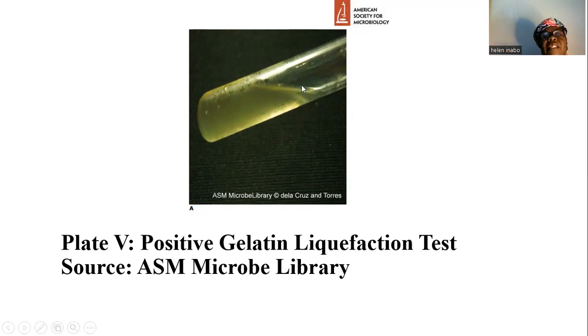See the evidence of gelatin liquefaction here, and it shows that the test organism has produced gelatinase, which hydrolyzes the gelatin, leading to liquefaction.